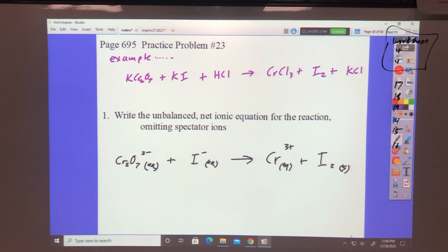Okay, it's just as well that we're doing this one, which should be organic 27C remotely, because I want to show you this reaction. There is a possibility that if something went drastically wrong, we would create hexavalent chromium.